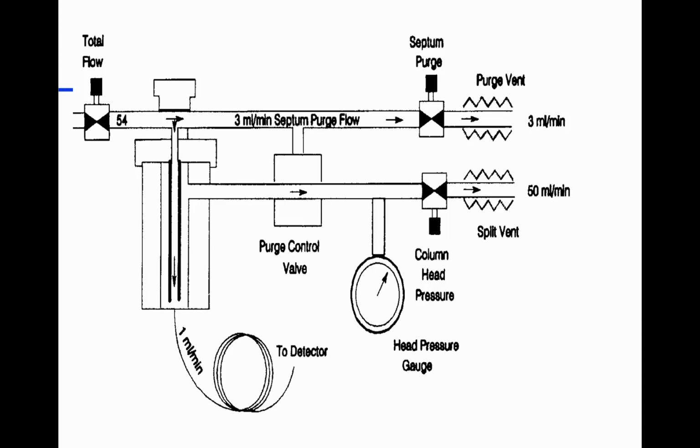So again, you learn after a while, maybe every hundreds of samples, I take this top off and I put in a new septum, so I don't lose my gas to come out here, my sample to come out here. We normally don't mess with that, but maybe somebody did. So again, you check your flows. You check your flow here. There's a seal between metal and glass here. And there's a nice little rubber O-ring there that keeps that metal and glass sealed together, so our gas doesn't go out this way, but in fact goes this way. I've taken these apart and had them be almost dust, they've been so ignored and haven't been looked after. There's another seal down here. So again, maintenance, looking after things, makes the difference on your chromatography, makes a difference on your data.